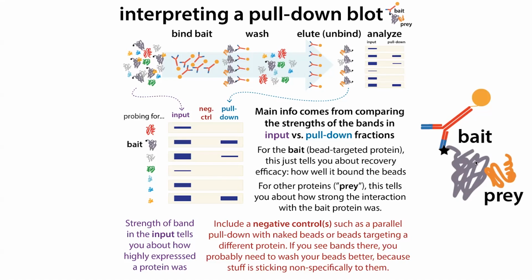So you often see, in experiments with nucleic acid binding proteins, a lane with plus RNase and minus RNase, to show whether this interaction is direct, or at least protein-protein, or whether it's mediated through the nucleic acid.